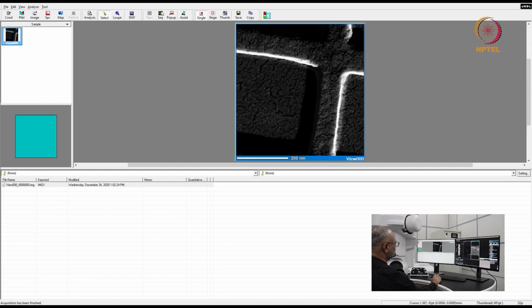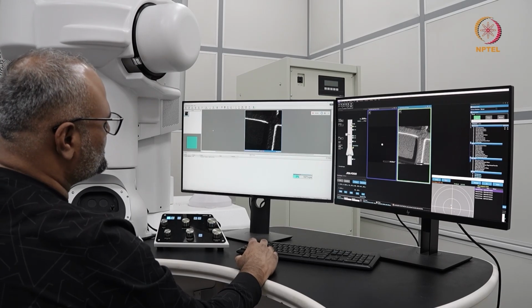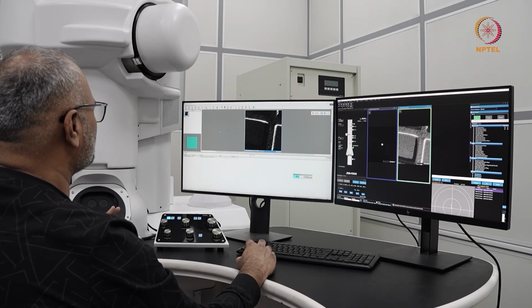And depending on the counts you have, the counts right now are approximately 1590 to 1700 counts per second, which is not too bad but not really ideal as well. But this is a gold thin film sample. Let us see what kind of a map we get.